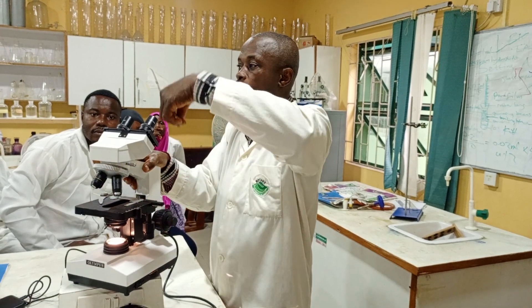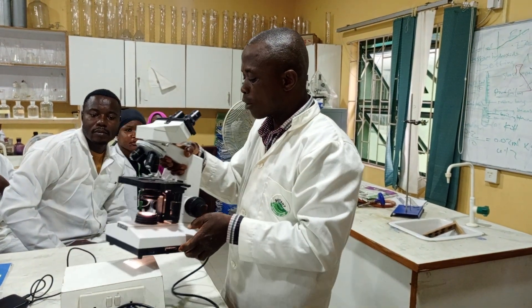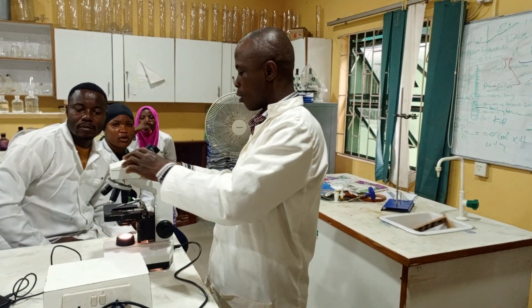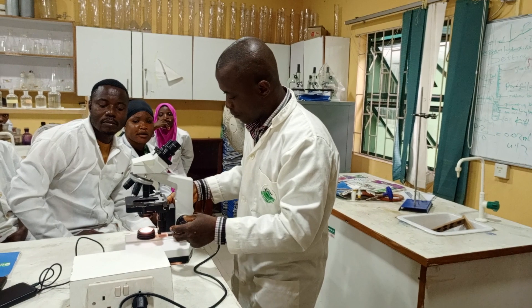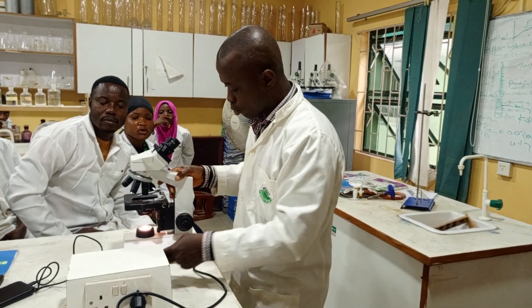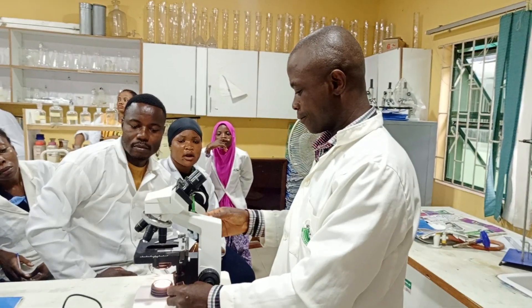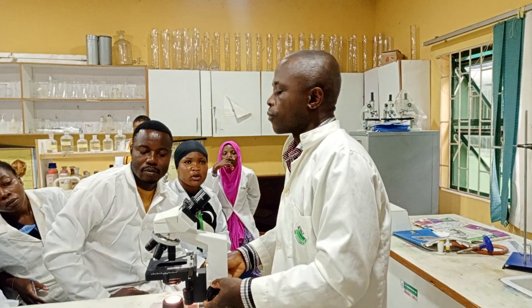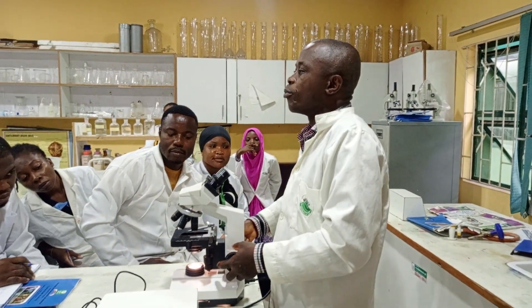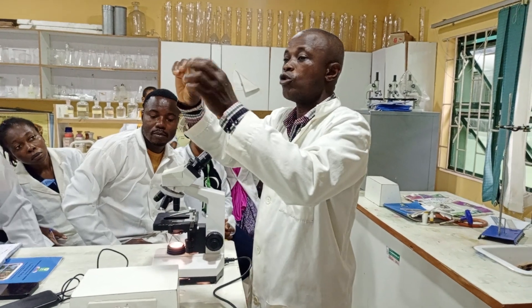The times 100 is an oil immersion objective — before you use this one, you put oil on the cover slip to examine it. Now, to bring a specimen to focus under the microscope, the first thing you do is plug your microscope into the light source, then carry it from the side. Use the coarse adjustment knob to bring the stage down so it will be easier for you to mount your slide.